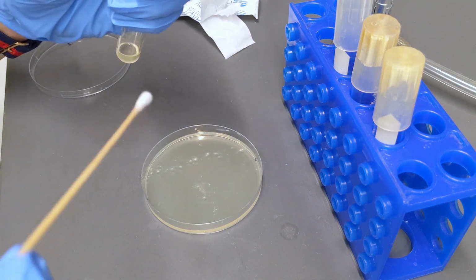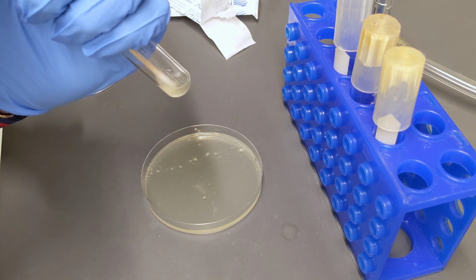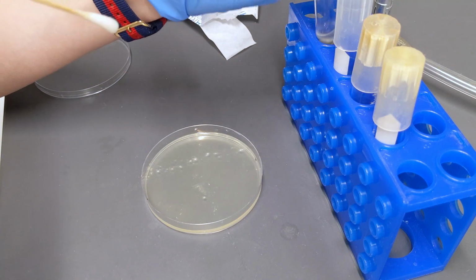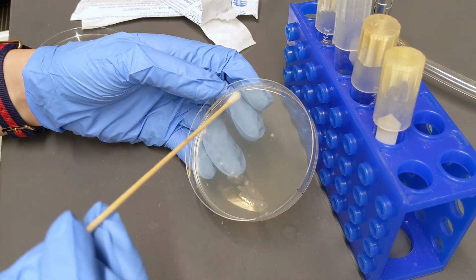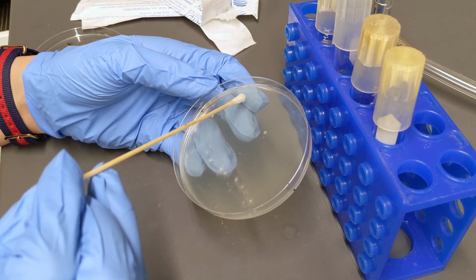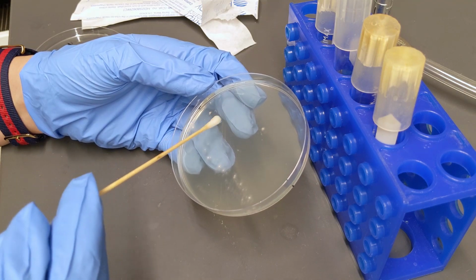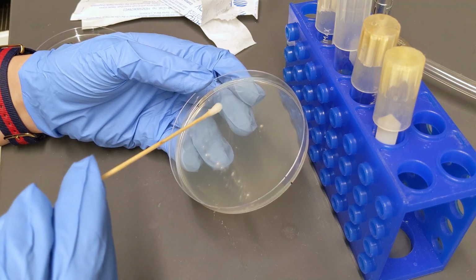Again, we dip the cotton swab into the E. coli culture and draw a stripe that is perpendicular to the P. rubens stripe. Keep in mind that once the swab touches the P. rubens colony, it has spores of P. rubens on it. Do not use the swab afterward, otherwise you will be spreading P. rubens all over the plate.